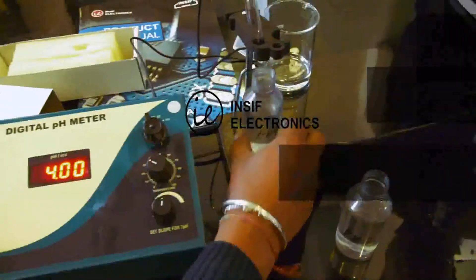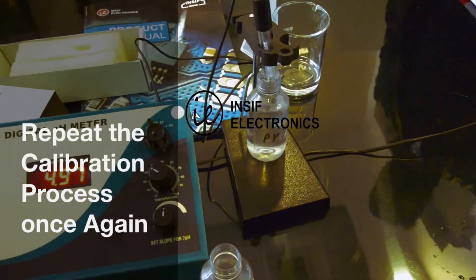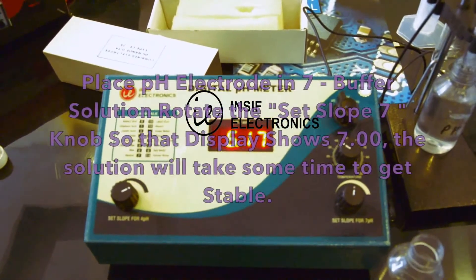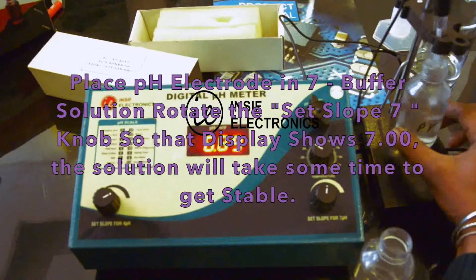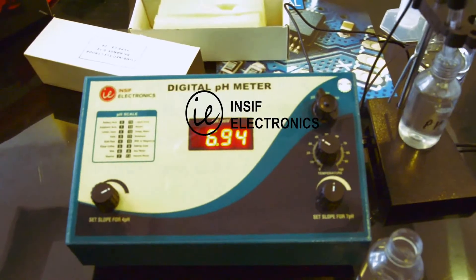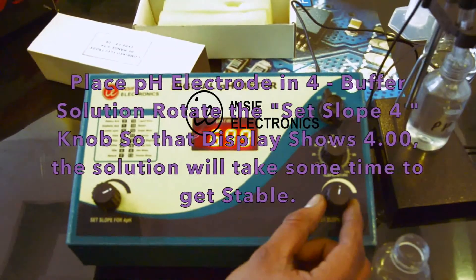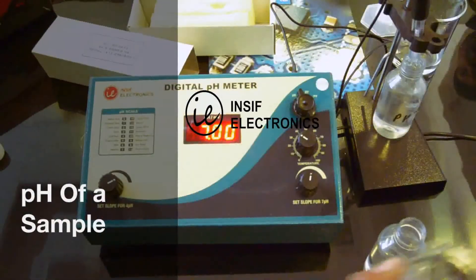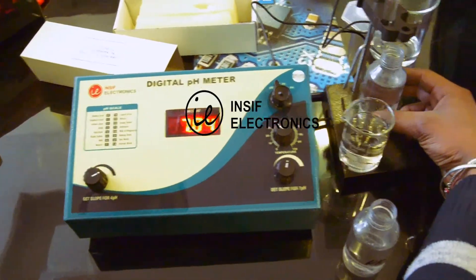Clean the electrode in distilled water then dip into the other solution, and repeat the calibration process once again. Place the pH electrode in the pH 7 buffer solution and rotate the set slope 7 knob so that the display shows 7.00. Then place the pH electrode in the pH 4 buffer solution and rotate the set slope 4 knob so that the display shows 4.00. Clean the electrode in distilled water. The meter is now calibrated and we are ready to measure the pH of a sample.